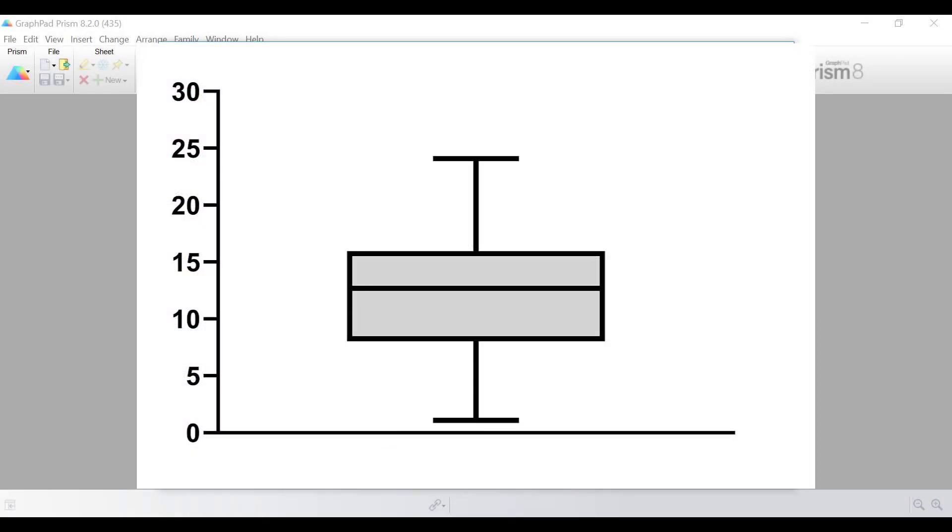So why are box and whisker plots useful? Box and whisker plots, also known as box plots, are a visualization style that gives you a sense of the distribution of your data along the y-axis and are often used to identify outliers. They are especially useful for comparing two or more groups of data on the same graph.